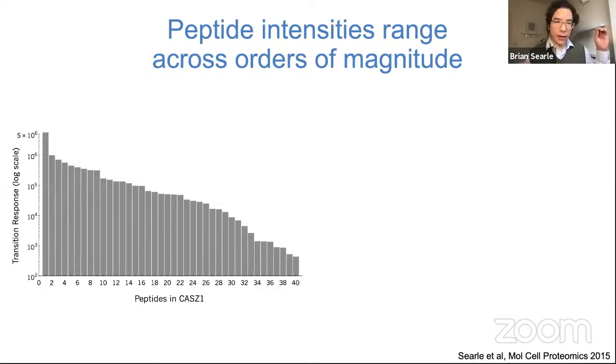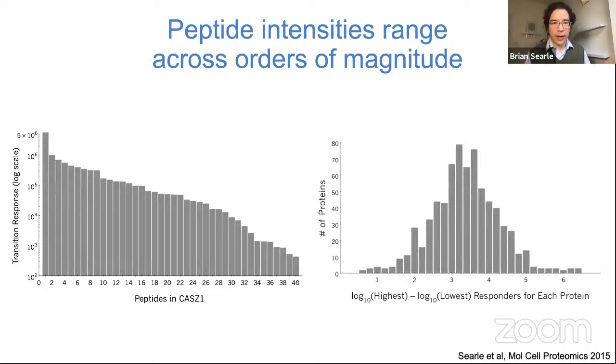Response between the best responder and the worst responder. And this is actually really common due to ionization. If we look across, in this particular case, I was looking at almost 1,000 different proteins in terms of their best response and worst response in equimolar proteins that were, in this particular case, synthesized for this very problem. So we knew we had the full-length protein and we had equimolar peptides for every single one of those peptides on column, or at least available to trypsin at that point.